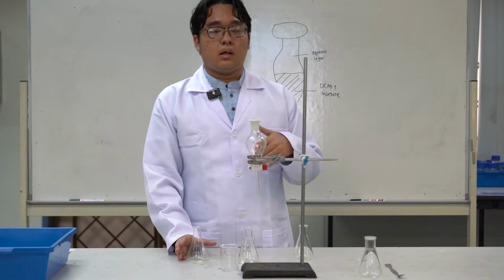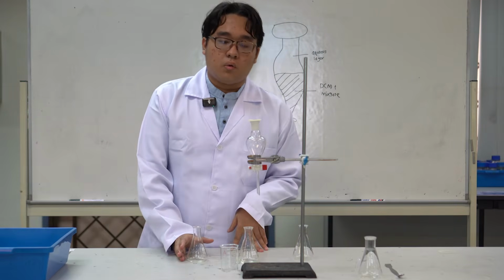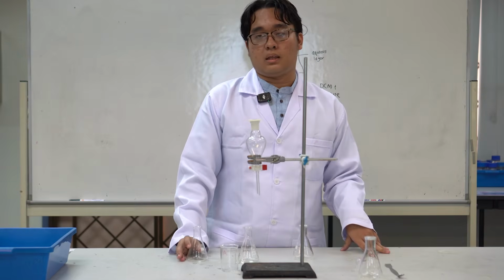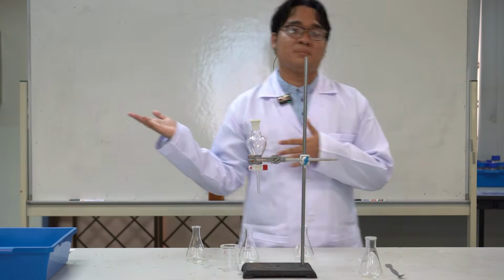So how do we make it soluble? We add DCM again, and that's how we will get the organic base basically. So that's all. I'll pass to Brother Akmal.